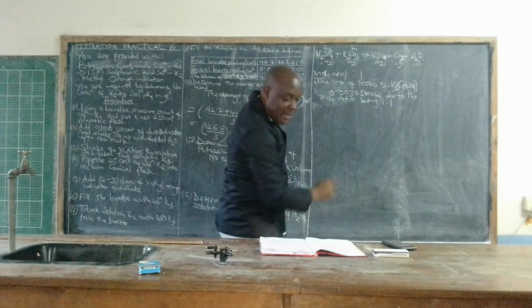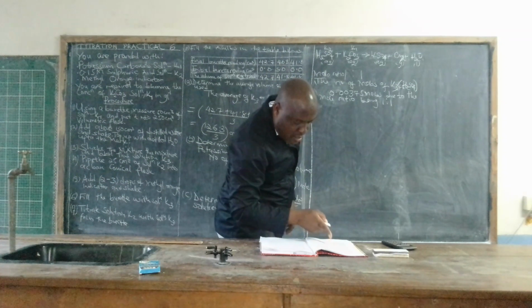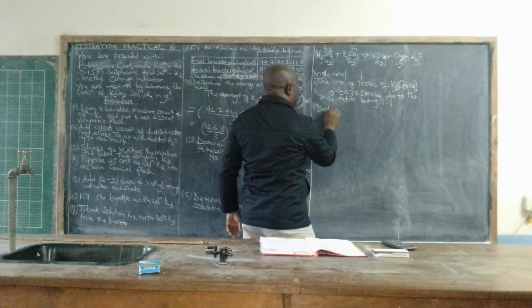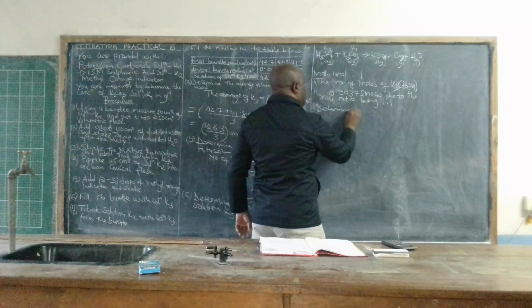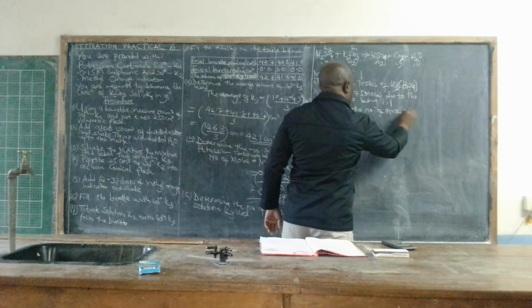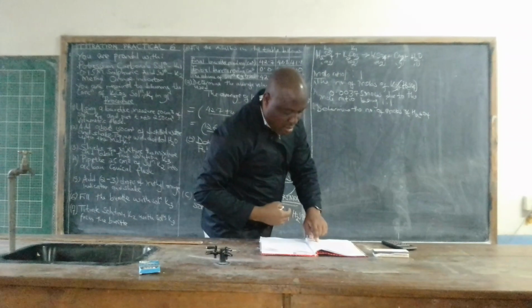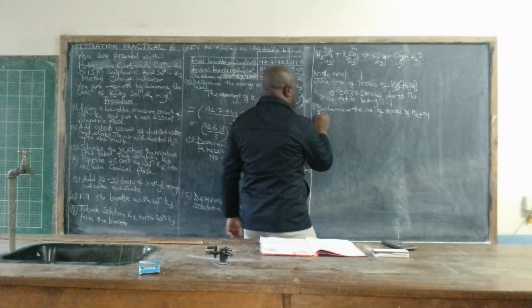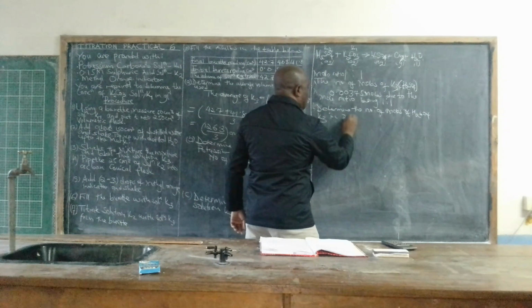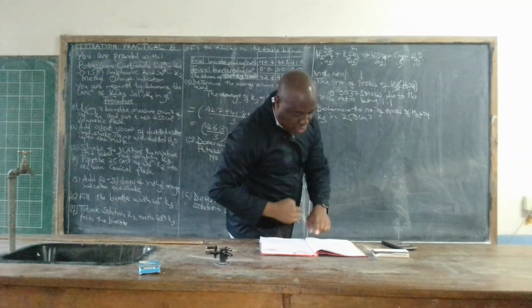We have been told to determine the number of moles of sulfuric acid K3 in 250 cubic centimeters solution.